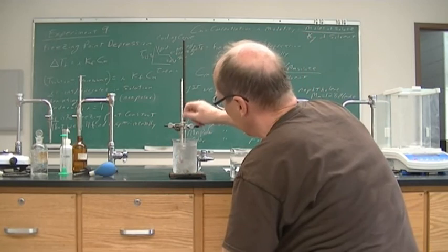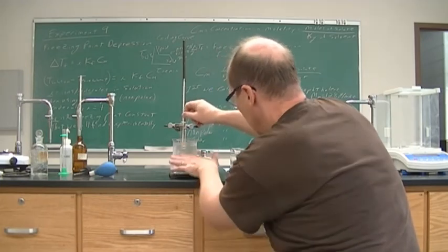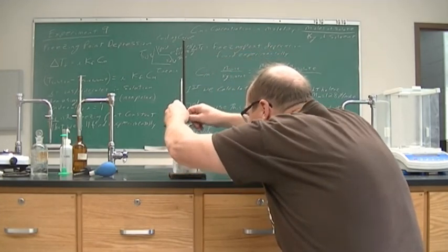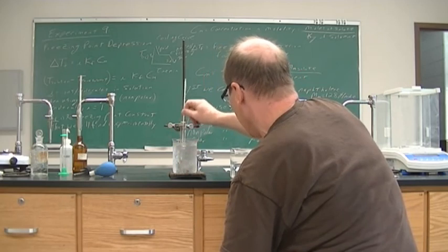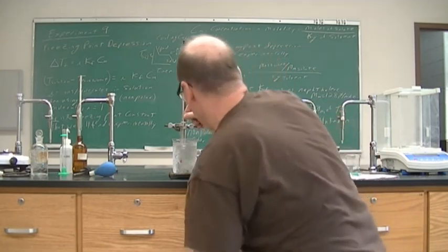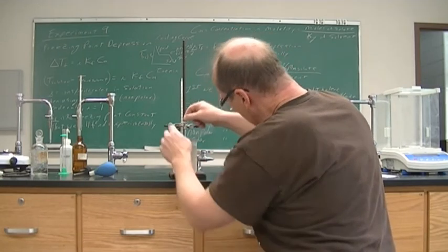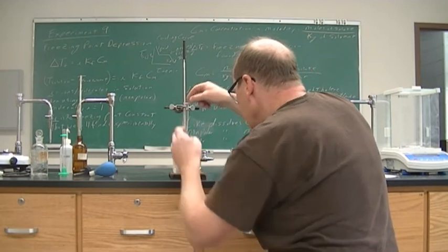All right, down to 3. It's down to 2.5. I'm going to pull this out pretty soon and see if I can see any solid in there. All right, still at 2.5. No, no solid.